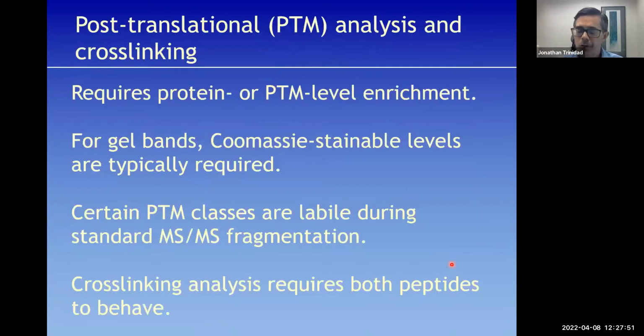Now I want to transition over to post-translational modifications. There's sort of two ways that this plays out experimentally, at least in terms of what collaborators want. Very often people have a protein of interest, and because it's running aberrantly on a PAGE gel, or because they're treating it with a kinase in vitro, or any number of reasons, they may believe that it's post-translationally modified, and so they'll give us some of this, and then we try to identify what's going on.